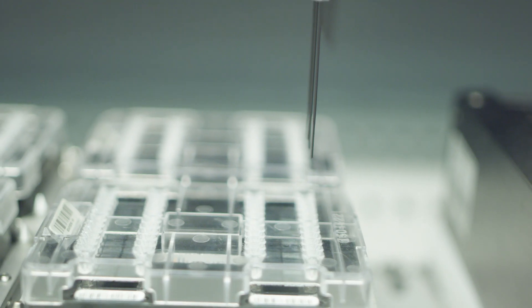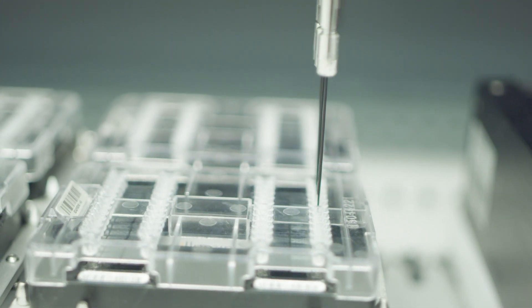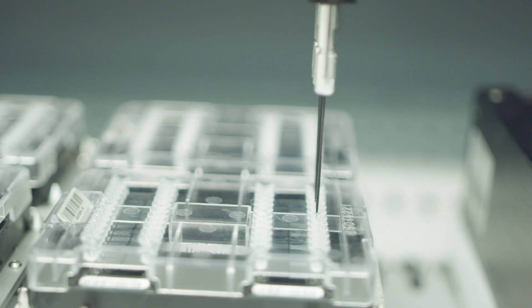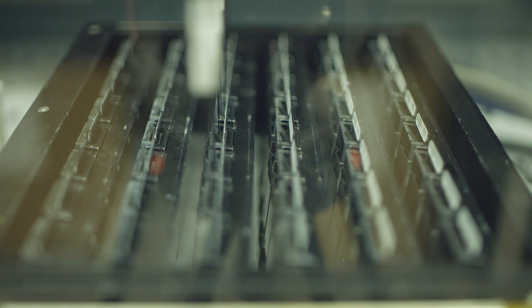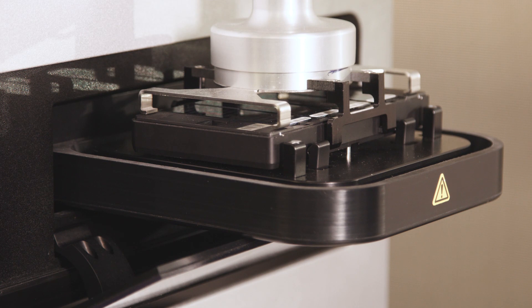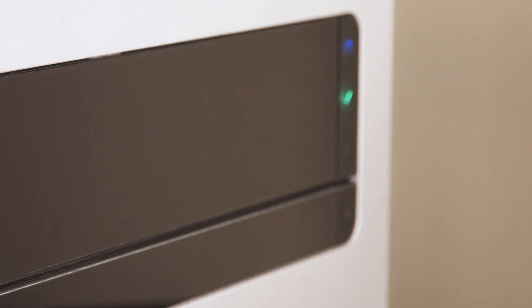The fragmented and resuspended DNA samples are then dispensed onto the bead chips. This step is followed by incubation in the hybridization oven. Finally, the bead chips are washed and stained. The fluorescent signal is now present on the chips. Unlike other technologies, all chemistry occurs before the sample is placed into the scanner. The Illumina iScan system reads the bead chip and records high-resolution images of the light emitted from the fluorophores. You've just gone from DNA to data with minimal hands-on time.